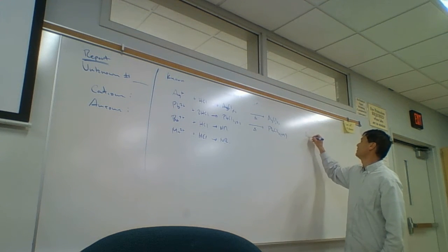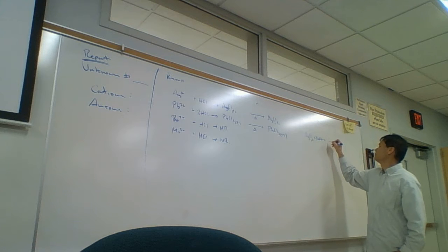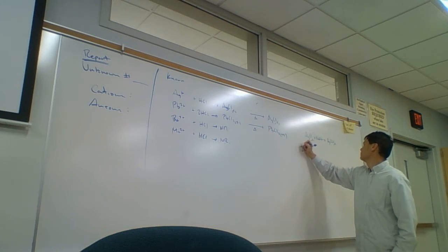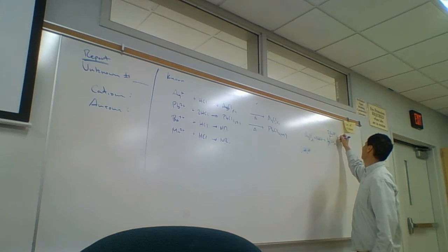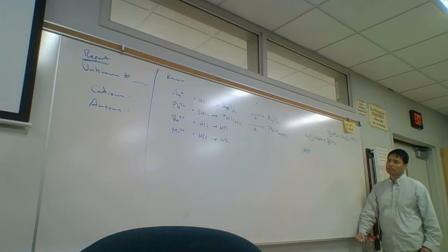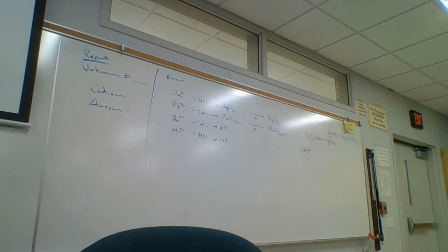Once we isolate the silver chloride, we're going to add some sodium hydroxide to that. That should form some silver hydroxide solid. But silver hydroxide solid is not so stable, so it will decompose. Let me write that up here like this: 2 silver hydroxide solids decompose into 1 silver oxide solid plus an H2O liquid. These are all the reactions that are happening here on this side. So this is the test for silver, pretty much.